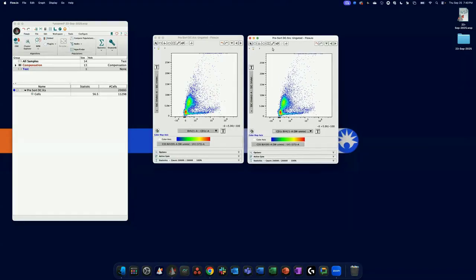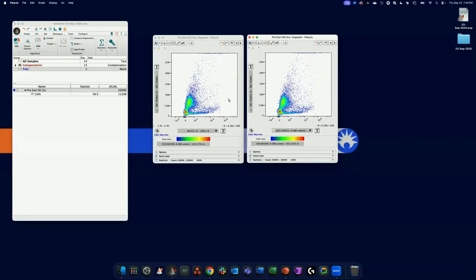Now the caution is that if you decide to edit the unmixing matrix, that will only impact the SW parameters. So if you edit the matrix, you have to give your attention to the SW. If you decide to recalculate the compensation, that will write new comp parameters, and now you can't use either of these; you'll have a new set of compensated parameters.